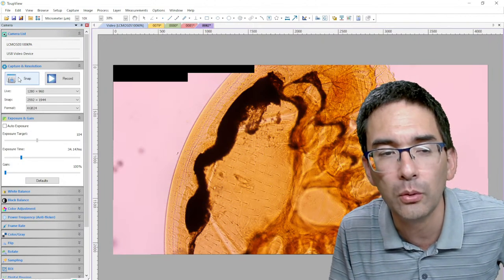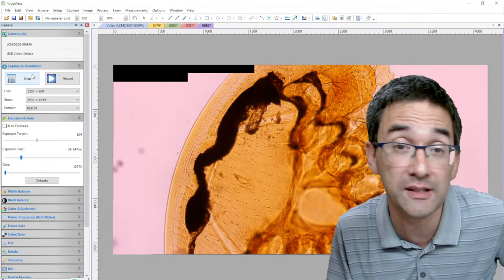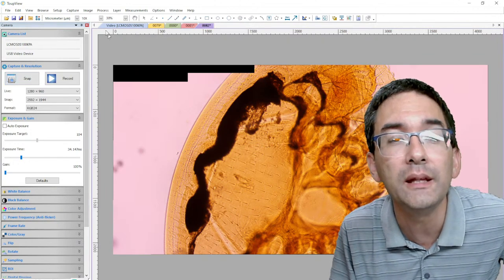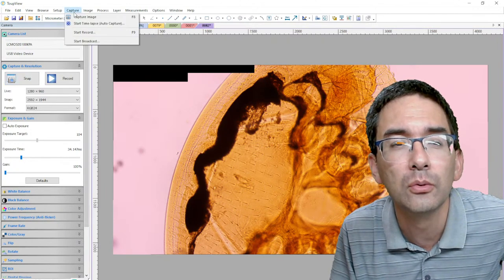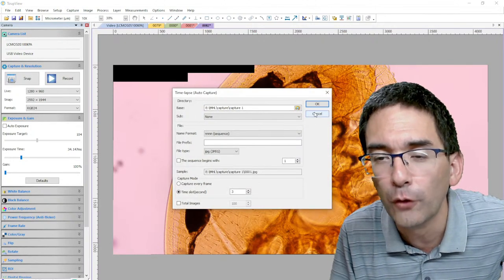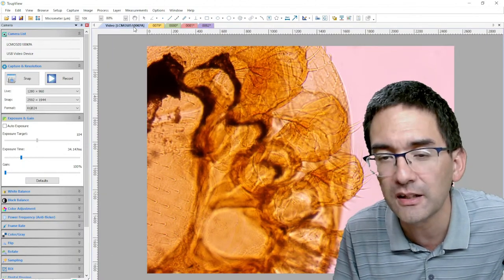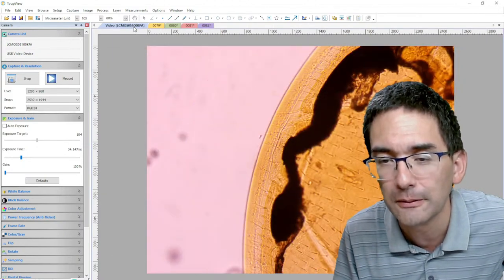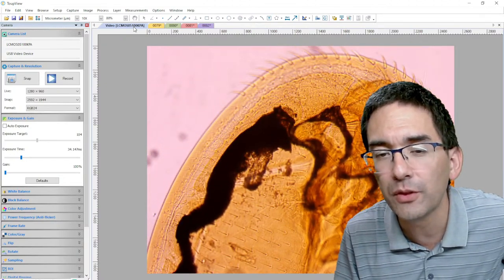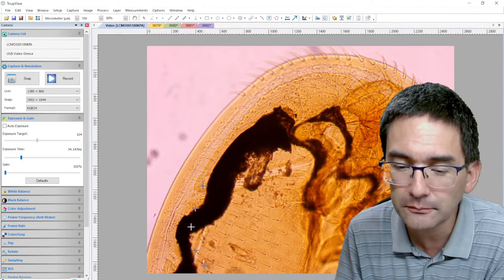This can be a little bit annoying or time consuming if you've got, let's say, hundreds of pictures to stitch. In this case, I also recommend that you use this automatic capture over here. And then instead of changing the focus, you just change the position a little bit every 3-4 seconds.